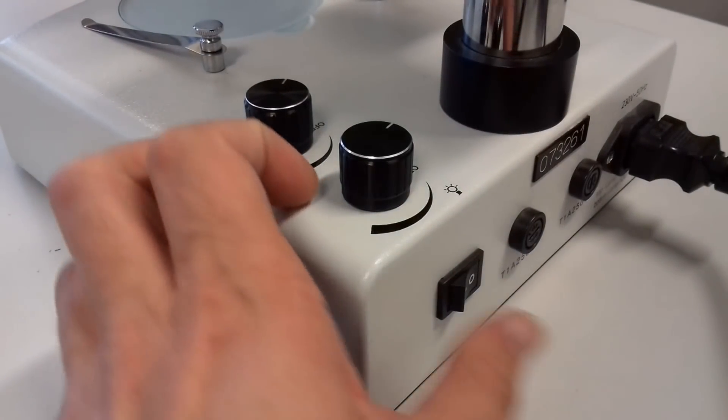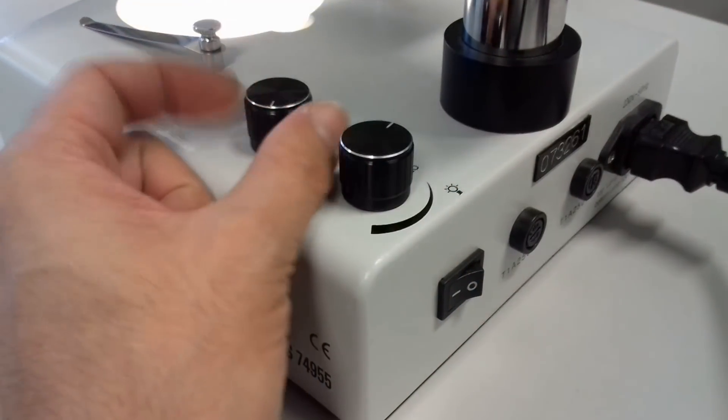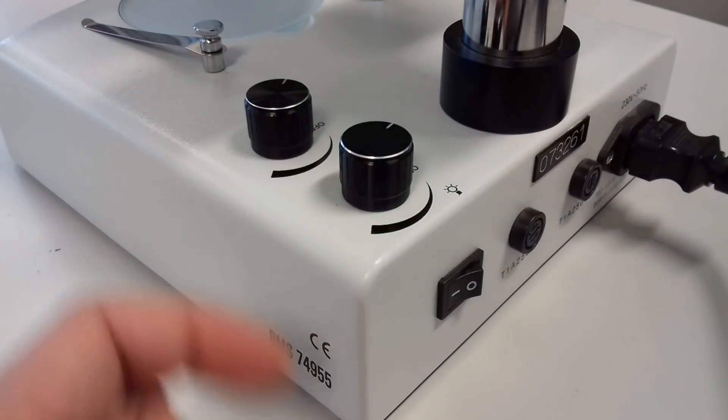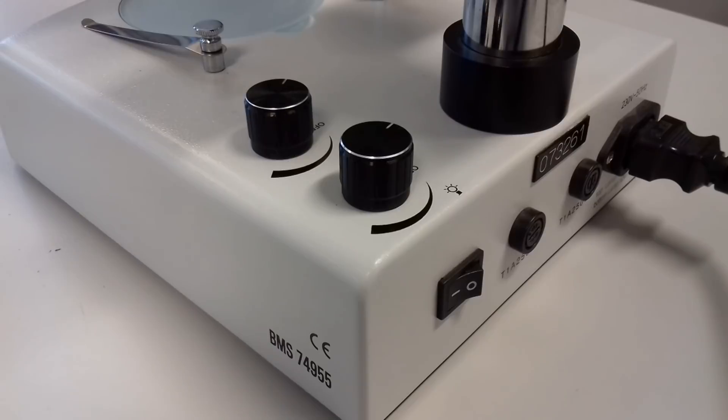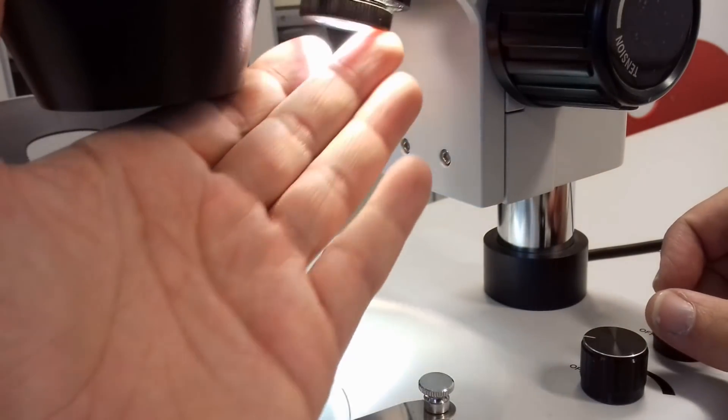And the first thing I want to do is I want to show you how to switch it on. There is of course a main switch on the back and there are two light intensity regulators. One is regulating light which comes from the top and the other one from the bottom. This is actually something that's very common in most stereo microscopes.